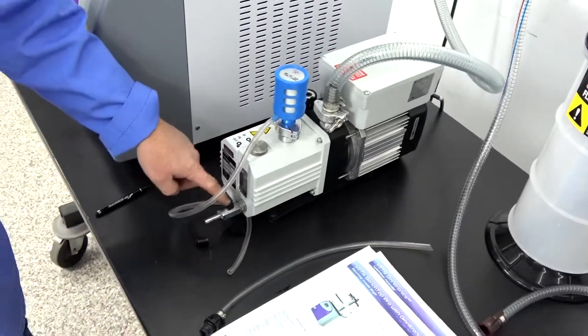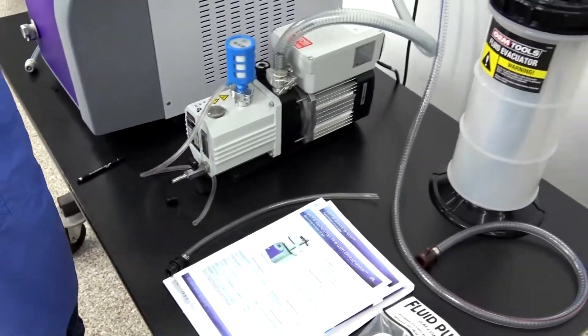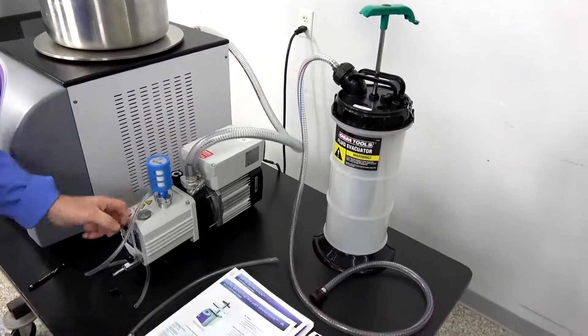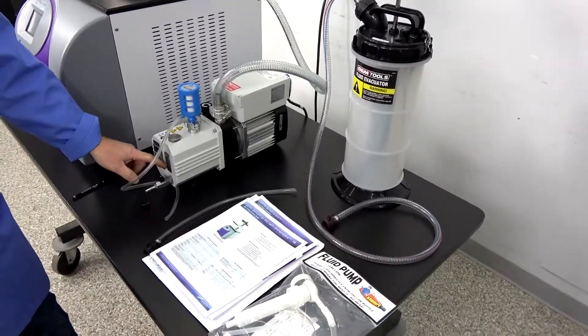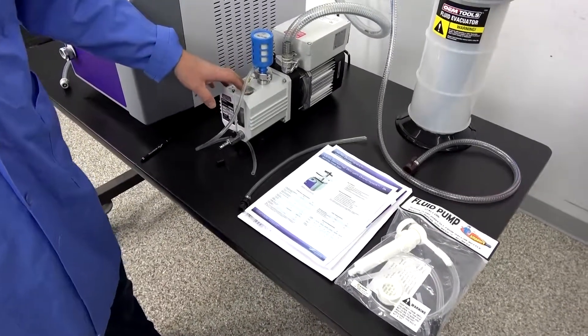We have the quick oil change valve here, and we are also including our fluid evacuation pump. It's just a quick attachment so you can evacuate the fluid on your vacuum pump really quick and get the oil changes done regularly like you need to.